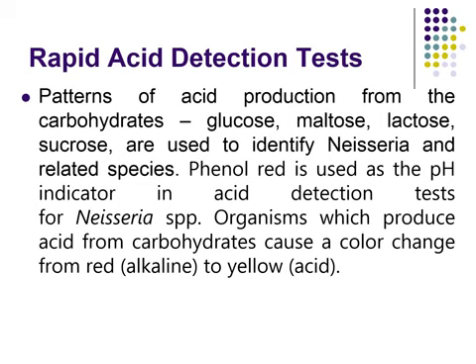Because Neisseria species are closely related to each other, many laboratory tests are used to differentiate between them. One of the most important tests used to differentiate between Neisseria meningitidis, Neisseria gonorrhoeae, and Moraxella species is the ability of these bacteria to ferment carbohydrates.